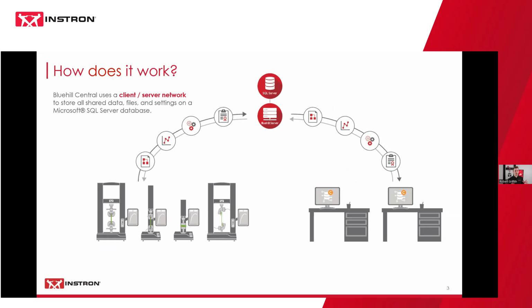But to talk about how Bluehill Central all works, I said at the start of this that there's a server that operates in the background where a lot of this information is stored. Bluehill Central uses what is called a client/server architecture, where you can store all of the shared data, files, and settings into a Microsoft SQL Server database.